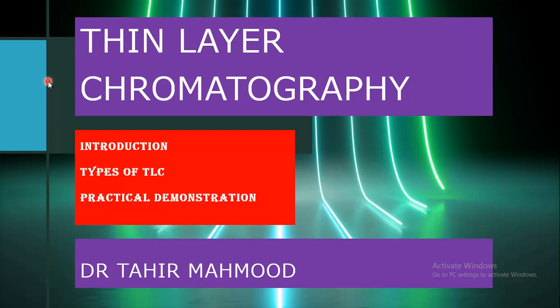In this video, I will explain what is thin layer chromatography, different types used for TLC, and then the practical procedure, how we can perform a thin layer chromatography practical.